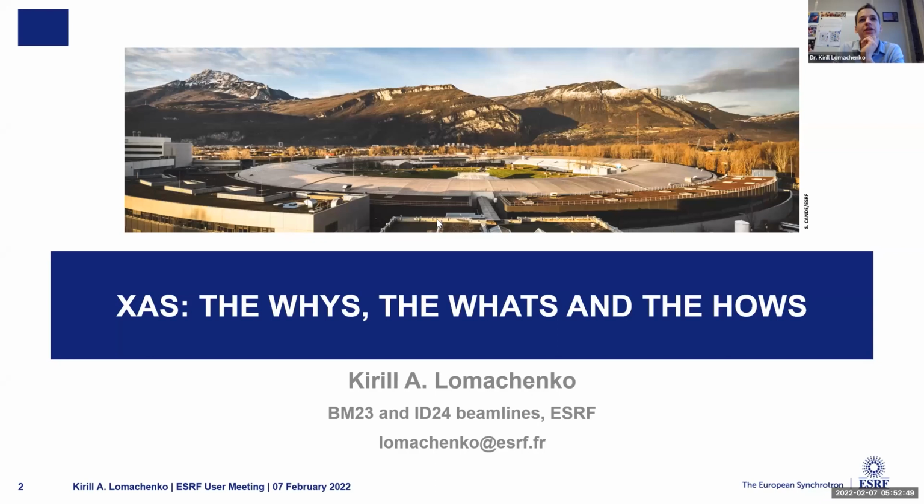Amrita asks, could such 2H EXAFS fitting be done for compounds with light elements like carbon and boron?